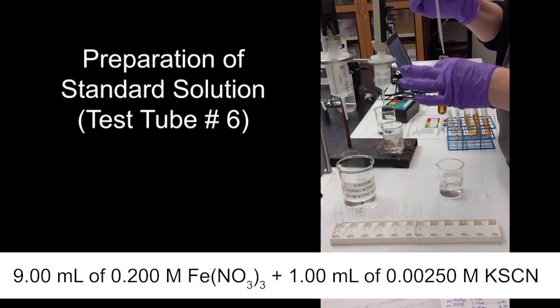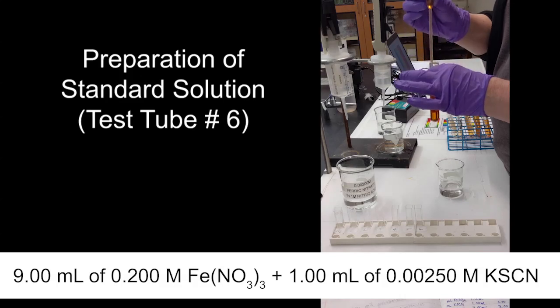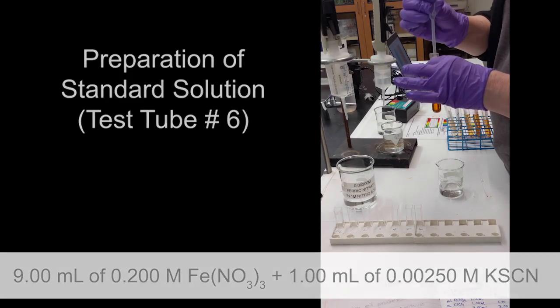And this one is my most concentrated value. So what I'm going to do here is essentially a Beer's law, where I'm only going to use a 2-point calibration curve. I'm going to measure the absorbance of DI water and set it at 0. And then in your pre-lab, we already determined what the concentration of this test tube number 6 is. This is our control.